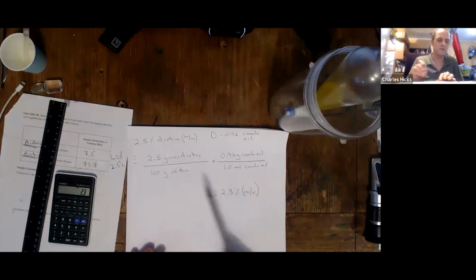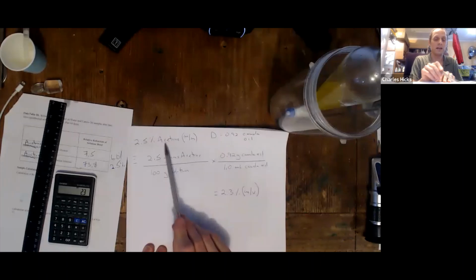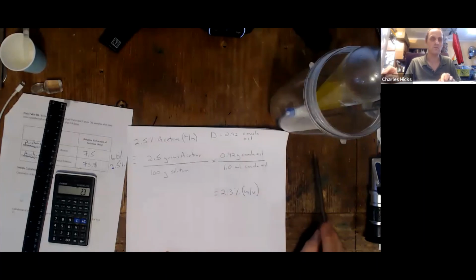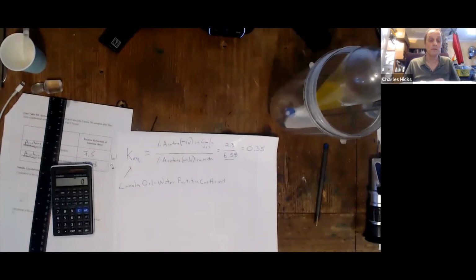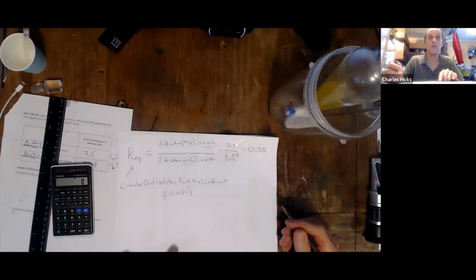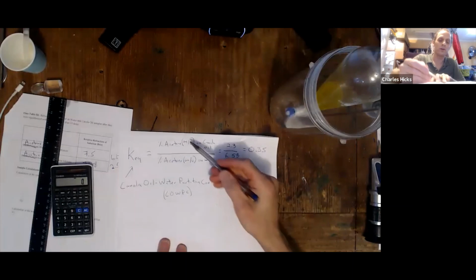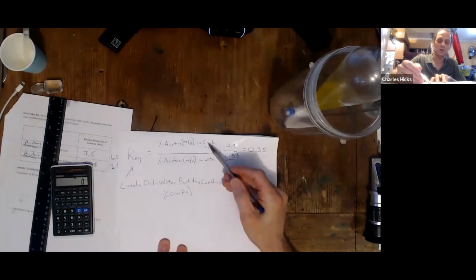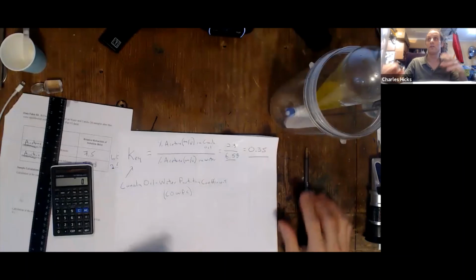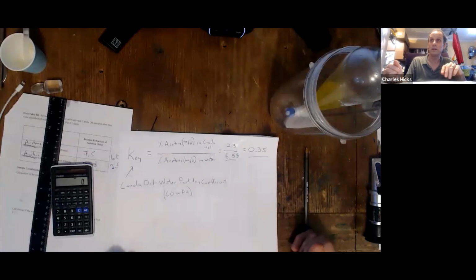Here is a similar calculation to convert the percentage of, in your case, will be the triethyl citrate. I did acetone, from MM to an MV description. We're just going to assume that the oil layer has the same density as pure canola oil. That's 0.92 grams. Finally, the calculation of the canola oil water partition coefficient, which is the equilibrium constant for the distribution between the oil and the water layers. It's just the ratio of the percentages MV in each of the layers, canola oil on top and water on the bottom. Calculates to be 0.35 for acetone. That means that regardless of the particular amounts that we throw into a mixture of canola oil and water, the relative concentrations we'll find are always in this ratio.